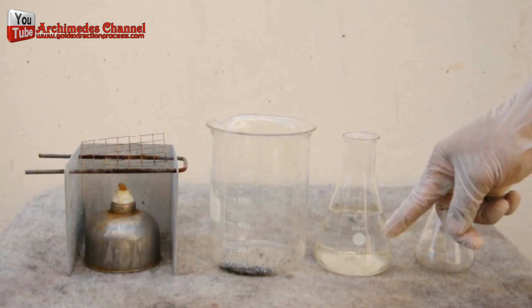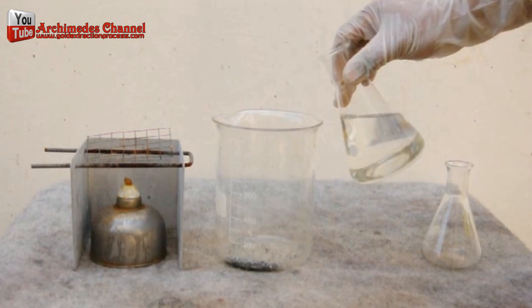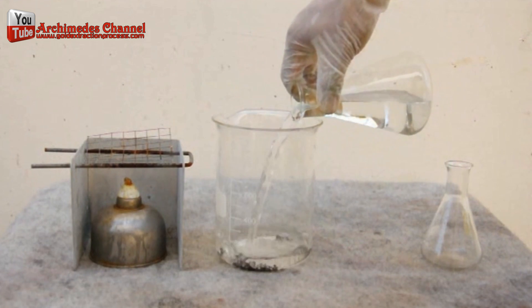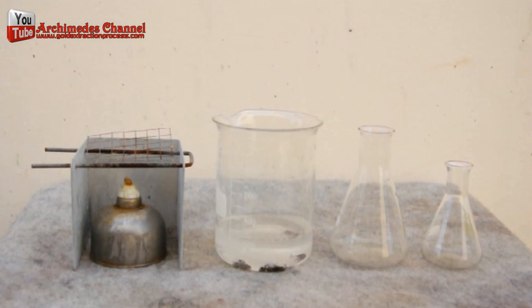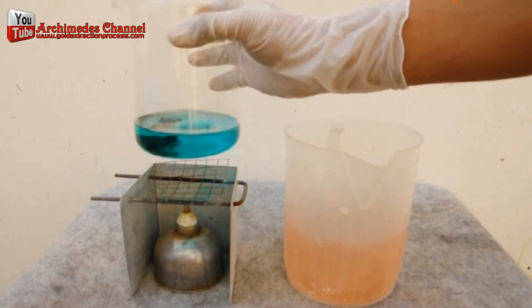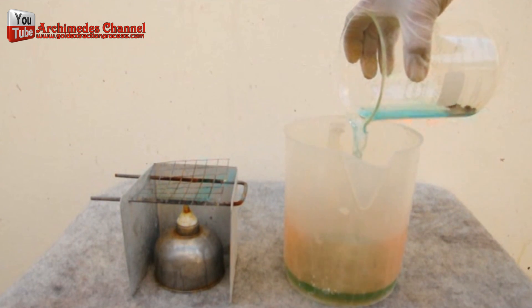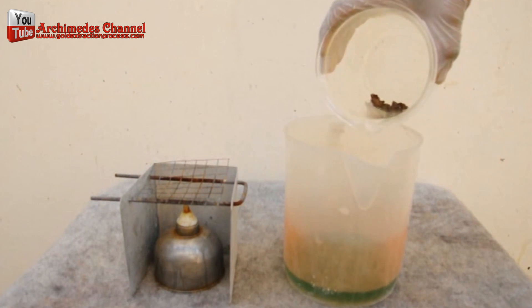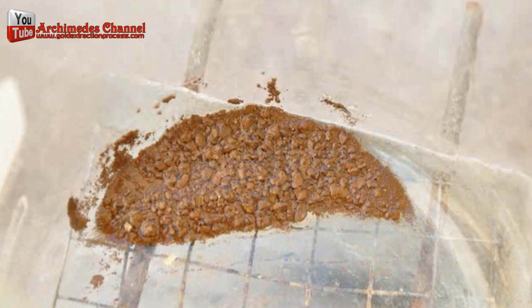Continue boiling until no air bubbles remain.